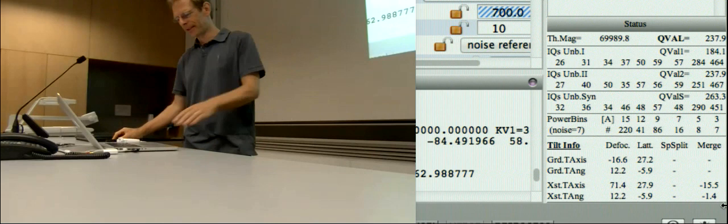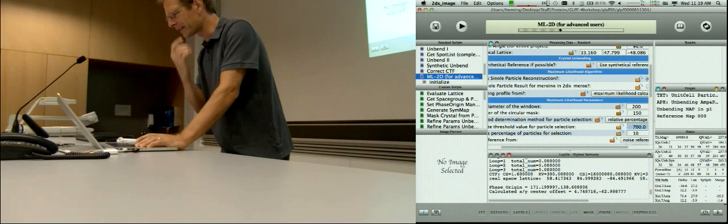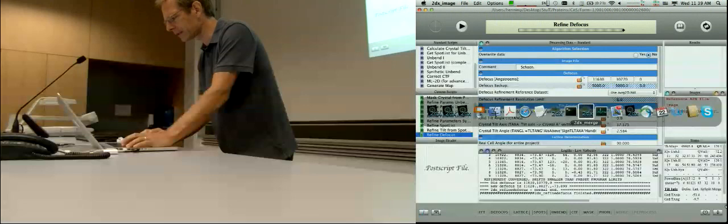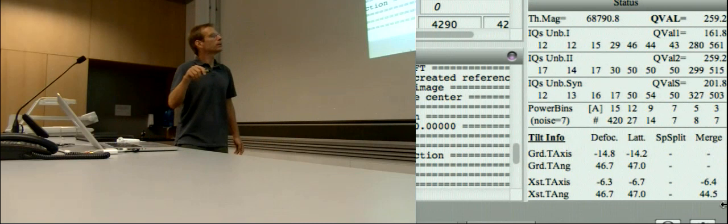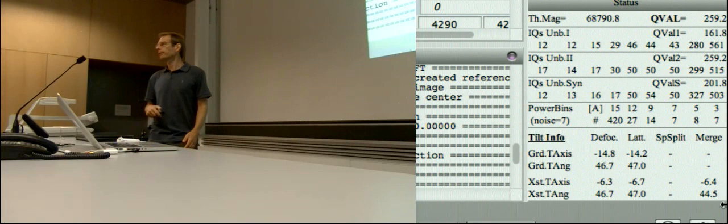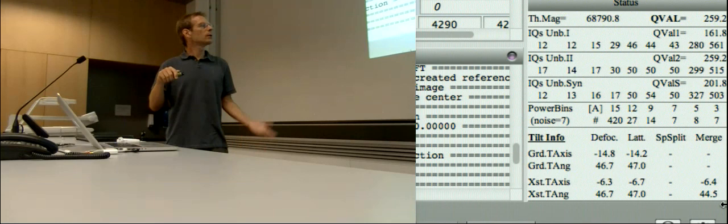This is a very bad example: defocus says this is 16 degrees tilted, but the lattice distortion is in a completely different direction, and merge gets still another answer. So here you can't trust the tilt geometry at all. But if you go to a tilted image — this one is 45 degree tilted — defocus says the tilt axis is roughly horizontal, minus 14 degrees, tilt angle 46. Lattice says 47, and merging says 44.5. On the microscope in Frankfurt we used the 45 degree sample holder, so it should be close to 45. So this one you could trust.